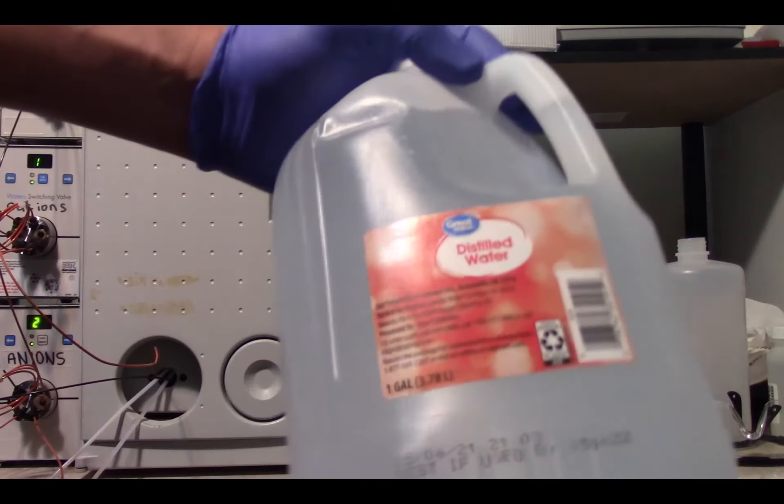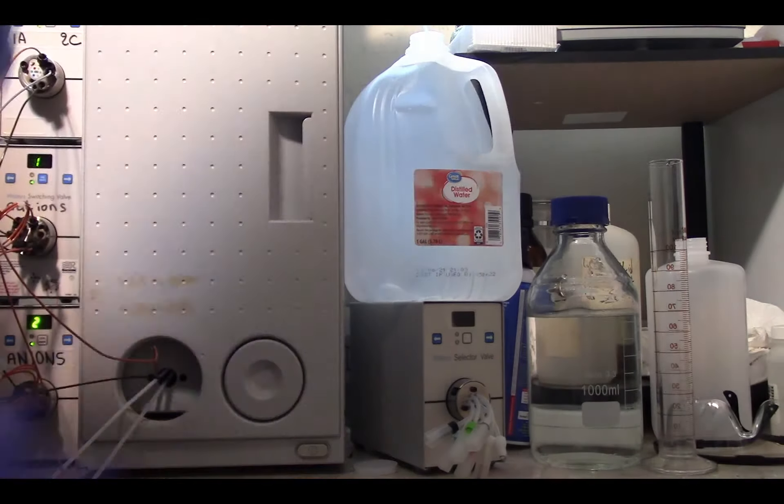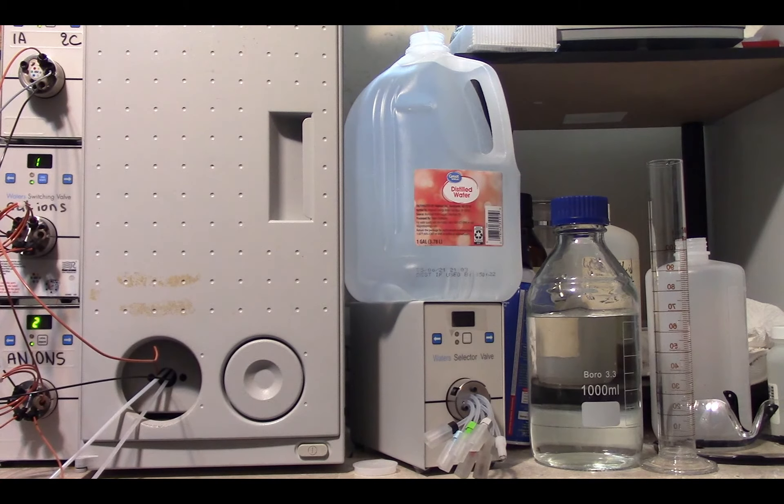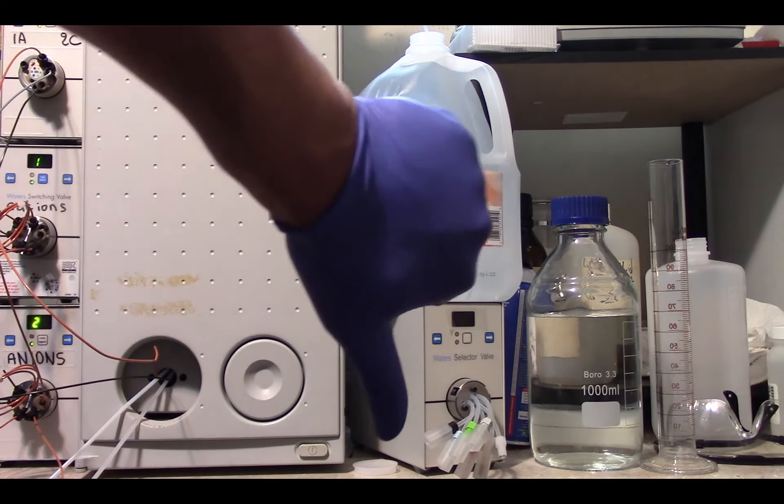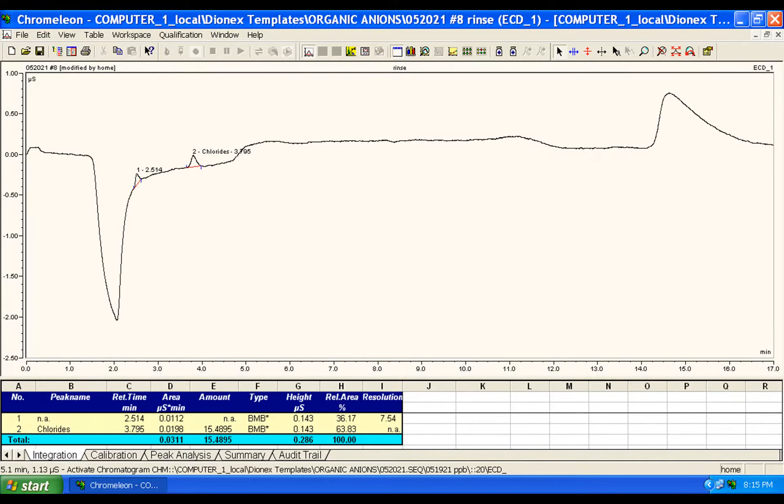I can hear some of you saying I could have used distilled water and it might be pure enough. Well, let me show you what it looked like down to PPB level. Not good. Almost a half PPM of chloride and three PPBs of nitrate. Now compare this with my pure water system. Now remember, this is very low level and humps are mostly due to noise and impurities in a sub part per billion level.